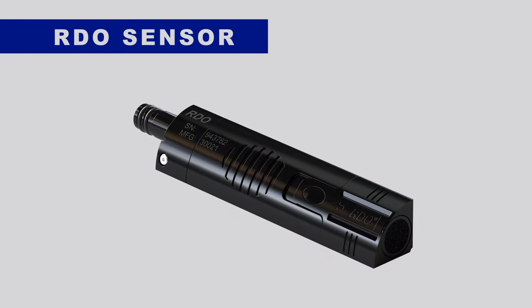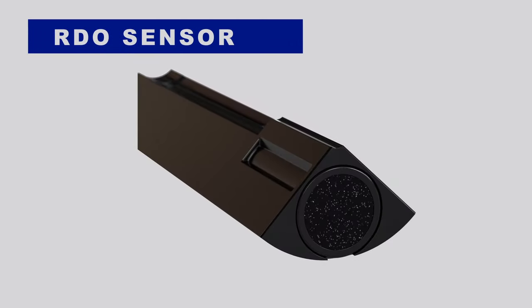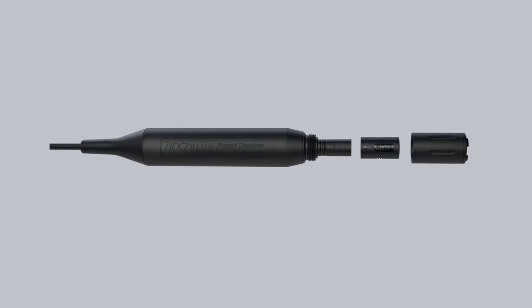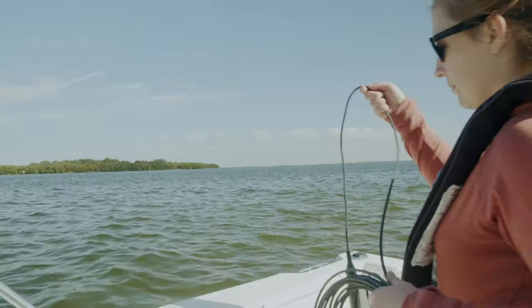For dissolved oxygen monitoring, RDO technology — available for your multi-parameter configuration or in the stand-alone low-cost RDO Blue — uses an EPA-approved optical DO measurement method.